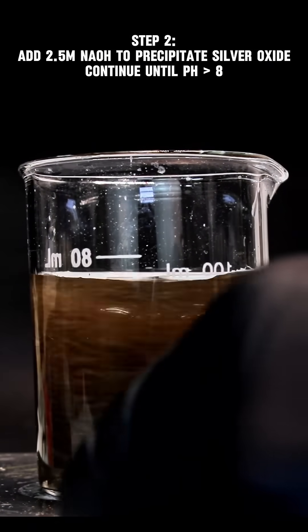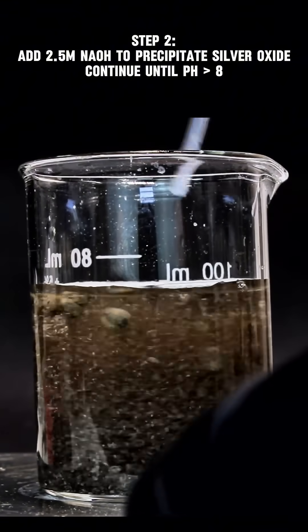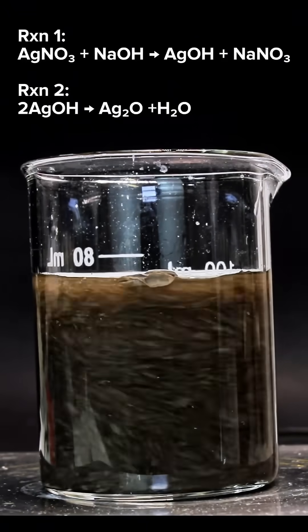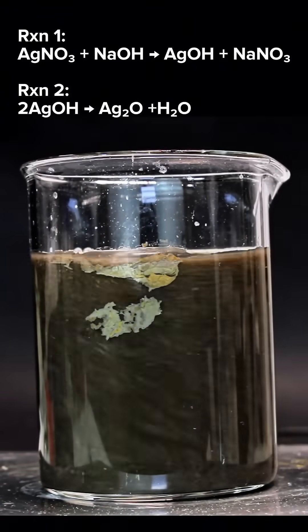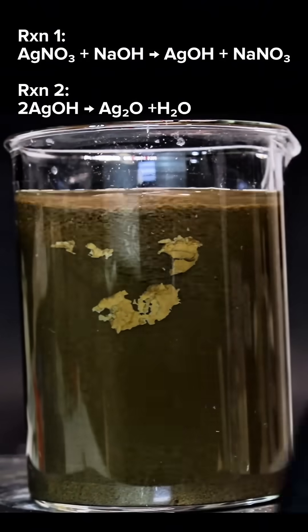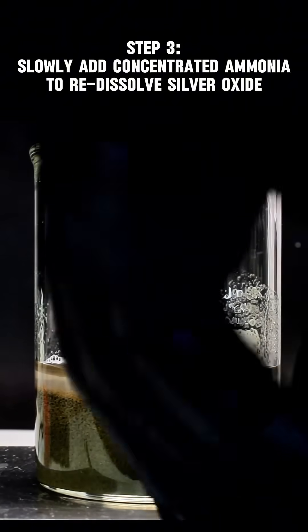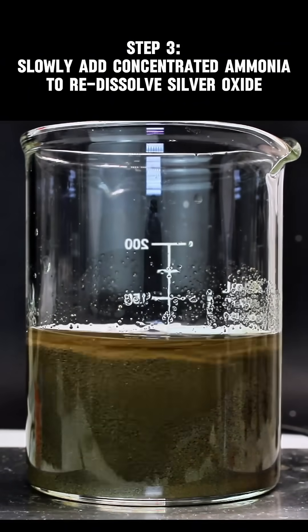I then begin to slowly basify my silver nitrate solution with a 2.5 molar solution of sodium hydroxide. Typically this type of reaction would produce a metal hydroxide, but silver hydroxide is incredibly unstable and immediately decomposes to black silver oxide. This is continued until no more silver oxide forms, and then I transfer this to a larger beaker and begin to add concentrated ammonia, which is about 30% strength.